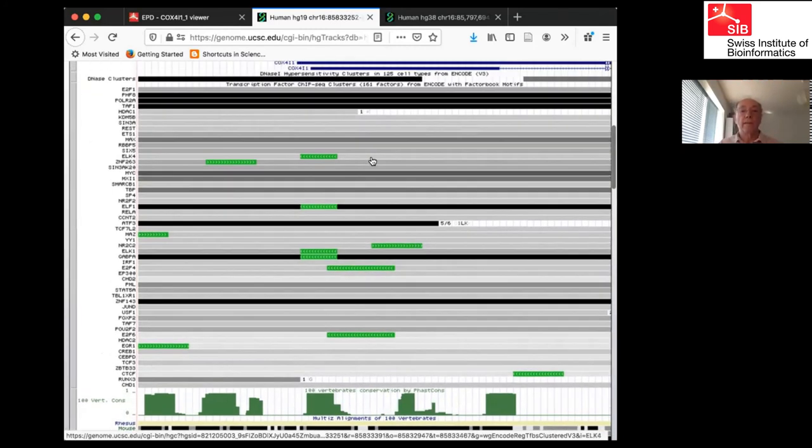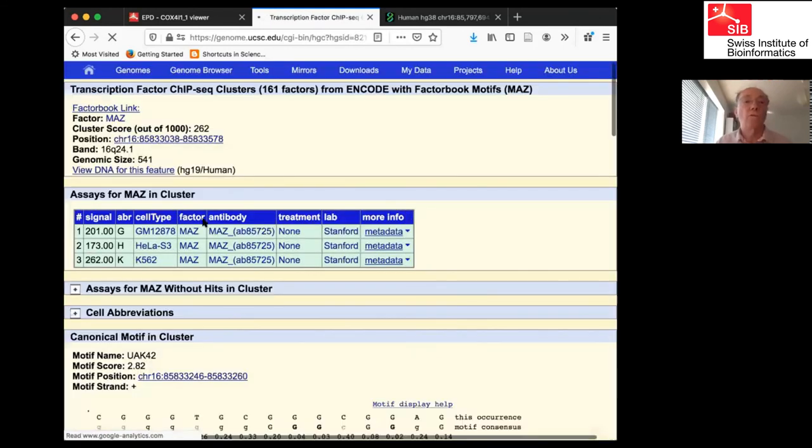What you can see here is that apparently there is a transcription factor binding site. It is for ELK4, for ELF1, for ELK1, and for GABPA. These are all transcription factors of the ETS family, and they have virtually identical binding specificity, so the motifs are basically the same. But obviously, these are different proteins, and so different members of the family may recognize the same sequence motif in the same promoter. What is really nice here is the precise correspondence of the ELK motif and the conservation peak. You can assume that this peak is probably also conserved.